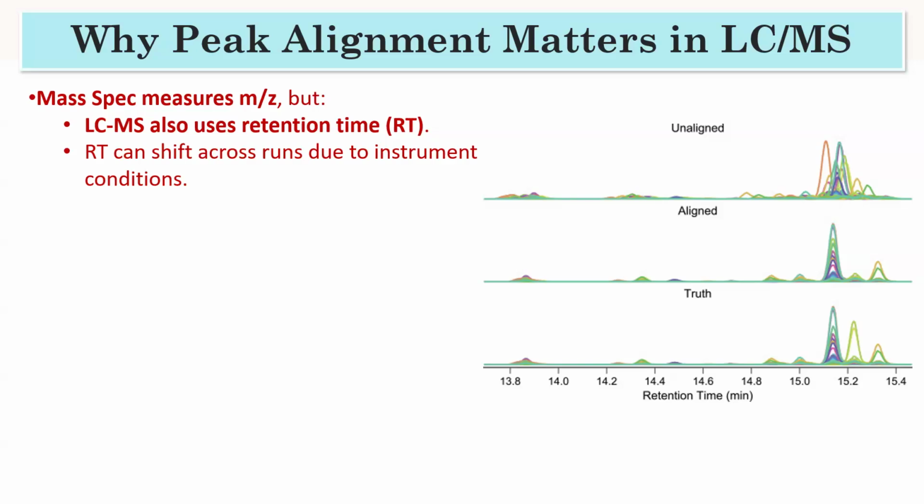Okay, someone is asking me: sometimes we have different mobile phases with different pH, basic or acidic. Why and when do we need to use different UV, A, B, or C? I don't understand your question actually. What do you mean by UV? Please write your question again, and try to say it more clearly so that I can understand better. Maybe after I finish I can answer your question.